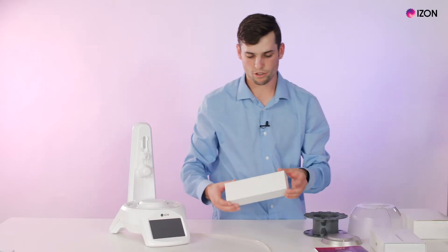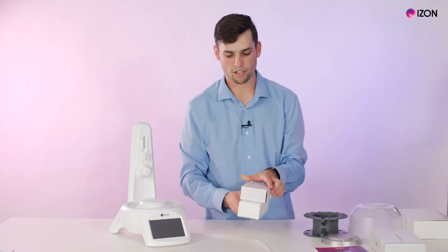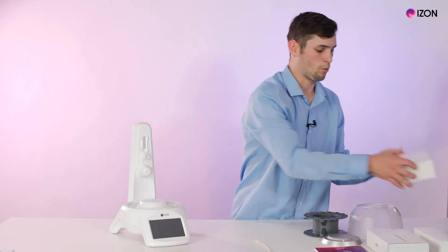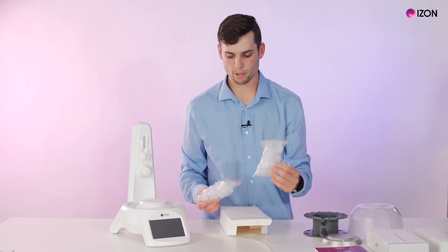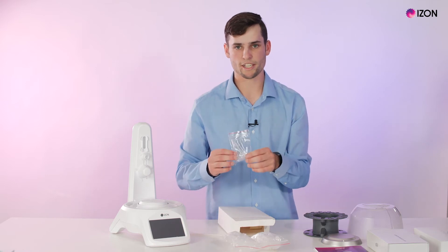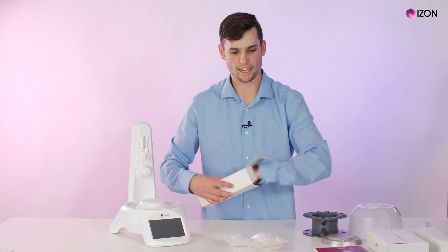We have the wall charger with the tube adapters, which go in this box, as well as the power cable for the AFC. We have a consumables box which contains centrifuge tubes in sizes of five mils and two mils, as well as a spare nozzle kit for the AFC, and we also supply a 10 gram weight.